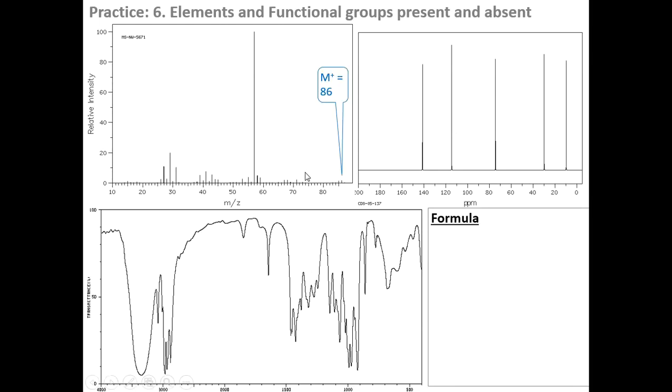So again, you start looking for the molecular ion peak, and you can see there are some peaks over there. It can be a little bit tricky, but that one, you can see there's 1 unit apart. That looks nearly 1-to-1, but because they're not 2 units apart, you know it's not bromine. Also, you know it's not bromine because the molar mass is too low.